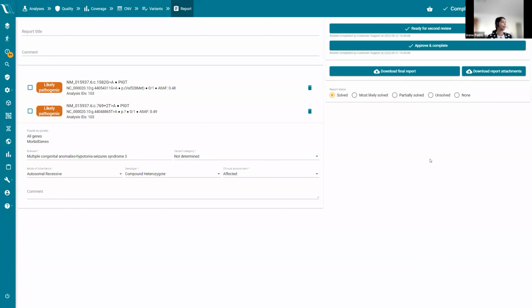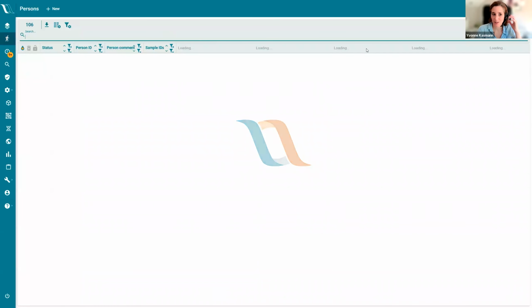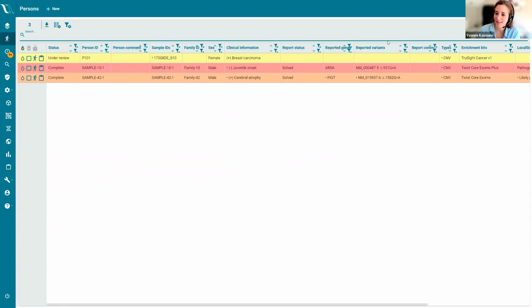Now, I would like to show you. Irene, just before you switch to another case, there are some questions that have been already raised.